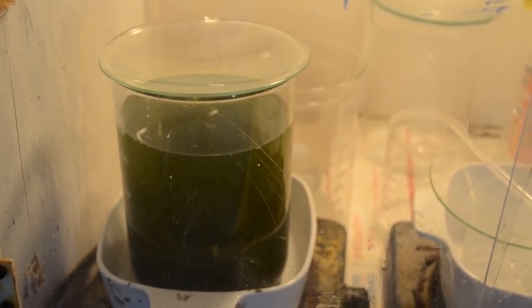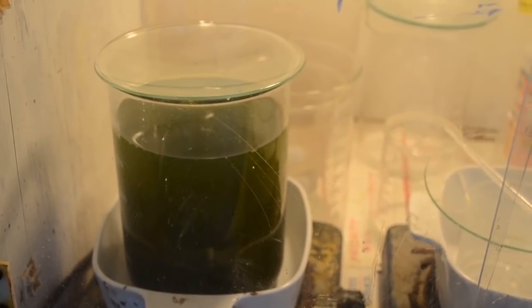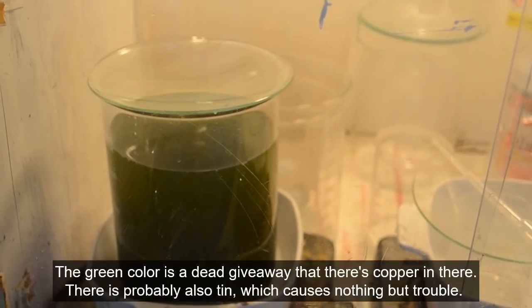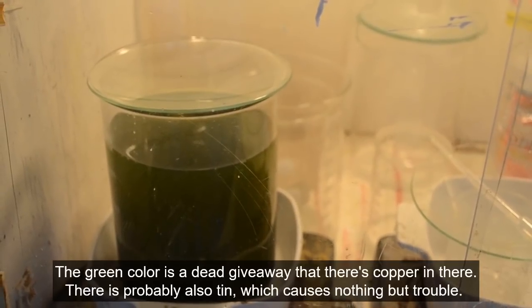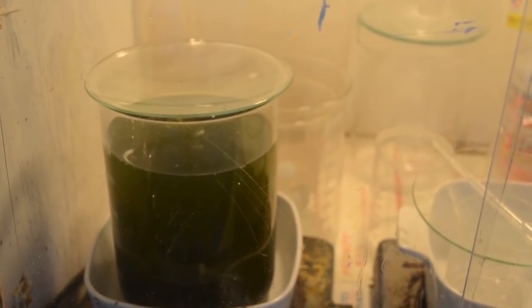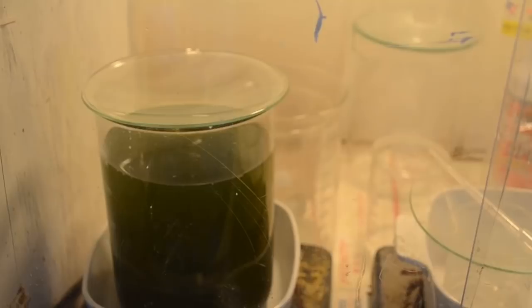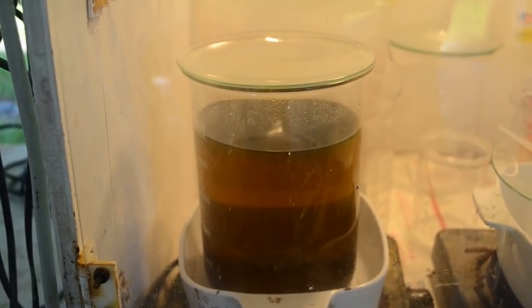I got a feeling the gold's gonna be very fine and probably contaminated with, could be lots of things. Obviously copper, but there could also be PGMs galore in there. So we'll see what we get in the morning, what it looks like, and what the consistency is, and whether I can clean it up, or whether I'll have to catch it all on a filter and re-refine it. We'll see.